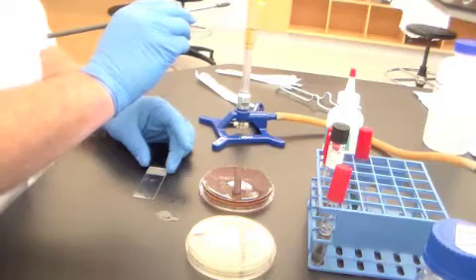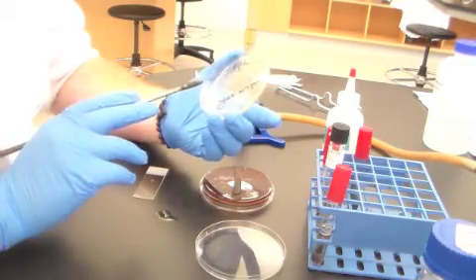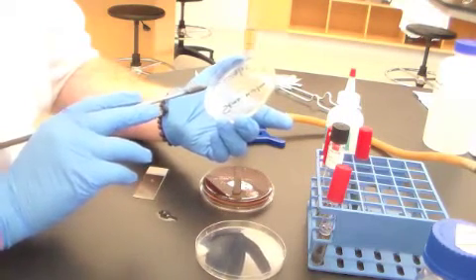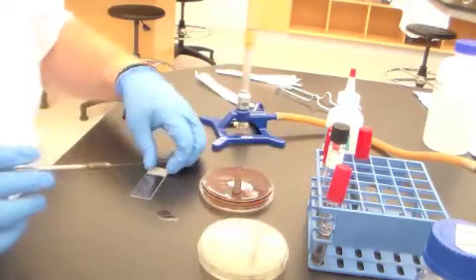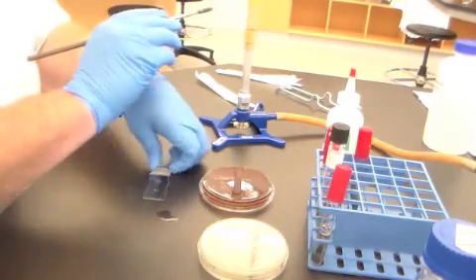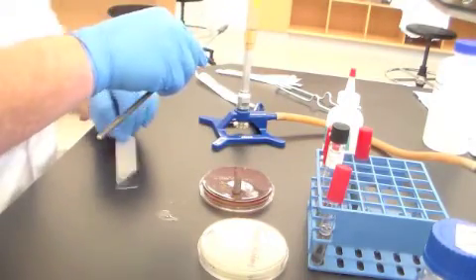And then right beside that, I'm going to place a spot of Streptococcus, in this particular case the dental pathogen, Strep mutans. This bacterium doesn't grow as well as Staph aureus. Staph aureus grows in the laboratory very luxuriantly. Streptococci don't grow quite as nicely. But I could easily get enough with a little pull through there to make a little smear.